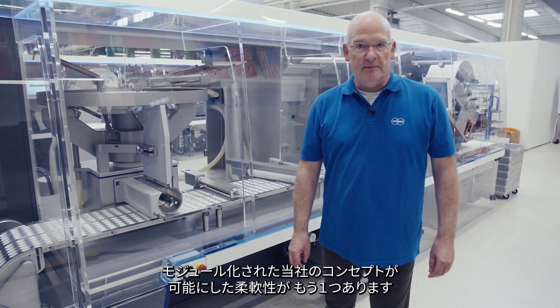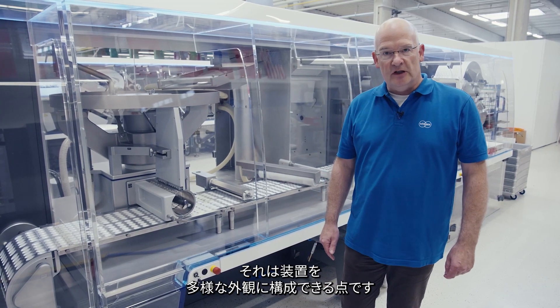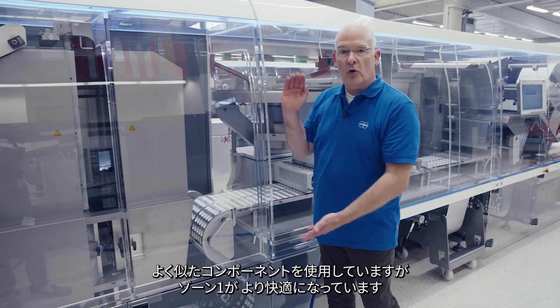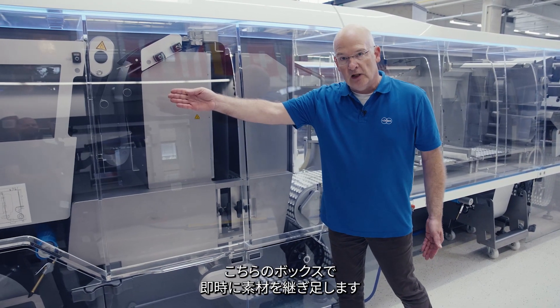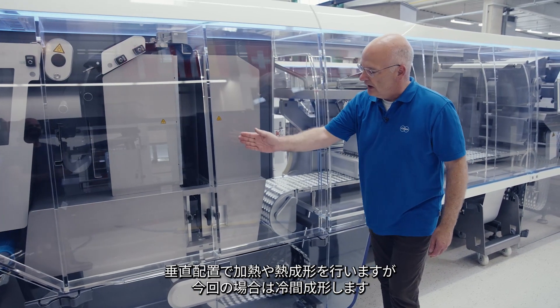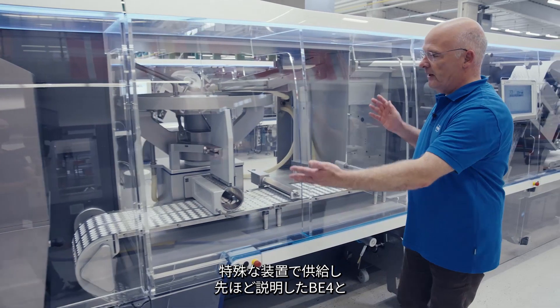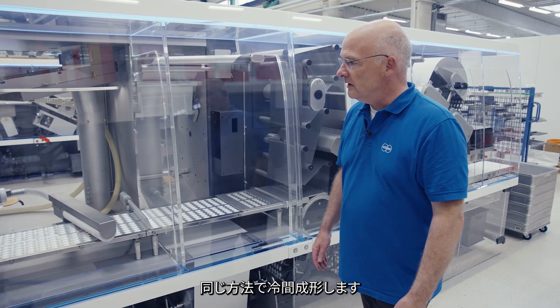Another proof of the flexibility of our concept, given by the modularity, is how we can configure the machine in a different appearance. This is the BE-8. Very similar components are used, but we have a machine with a much more comfortable setup, where the bottom material is coming from a cart. A buffer box allows the splice of the material on the fly, and in a vertical arrangement: heating, thermoforming — or in this case cold forming. A large cavity is cold formed, fed with special feeding equipment, and treated in the same manner as we studied before on the BE-4.